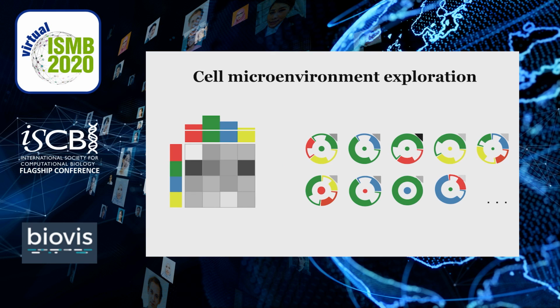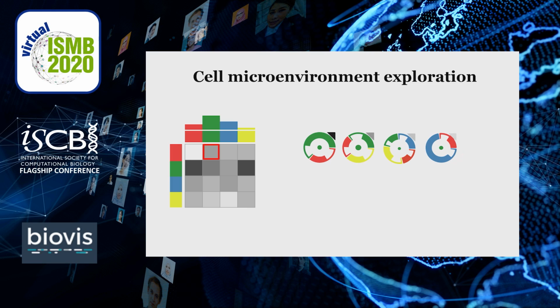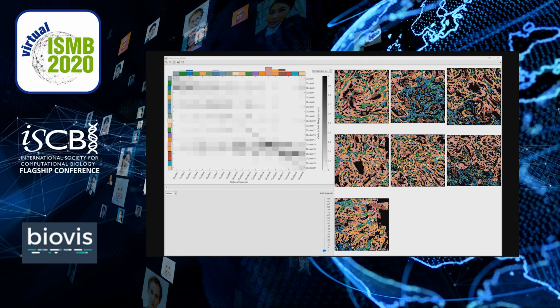We enable the user to filter them using the overview heatmap. Selecting a box of the heatmap immediately filters the motifs, retaining only those with a corresponding interaction. The expert can also further navigate among them, reordering them according to their significance, or the amount of cells grouped under the motif. All the aforementioned tasks have been implemented in an integrated system, with multiple linked views. For the remainder of the talk, I will give you a brief demo of our tool, based on a case study that can be found in the paper.